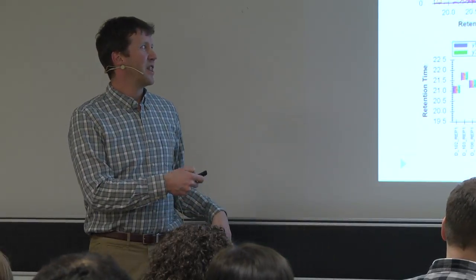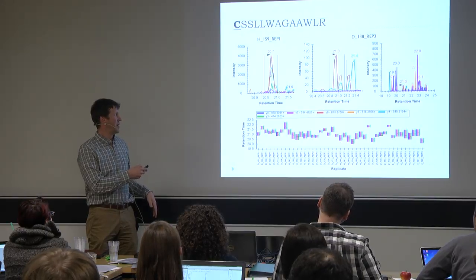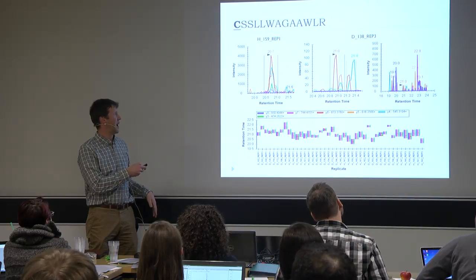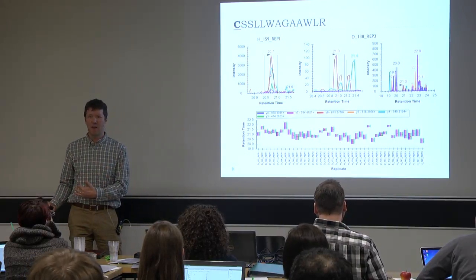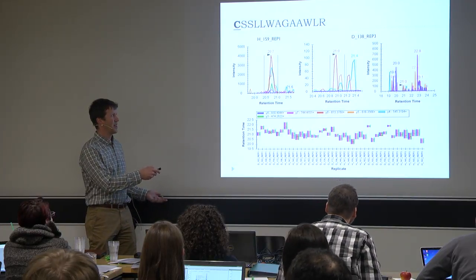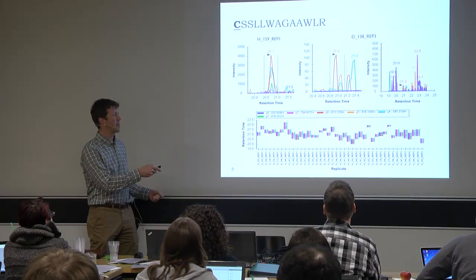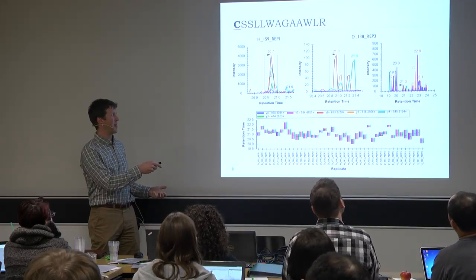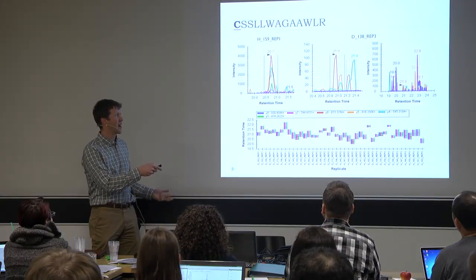So this is what the data looks like when we go look at the chromatograms, and it's not fantastic, but basically every healthy run looks kind of like this, and we do see coelution of at least 5 transitions, which is pretty good. It's definitely a peptide, so there's some peptide there. And when we look over here, this is my best attempt to integrate something that looks like this. It's really very close in retention time. It's so low in intensity that maybe we don't really get great coelution, but basically the relative intensities are kind of right.